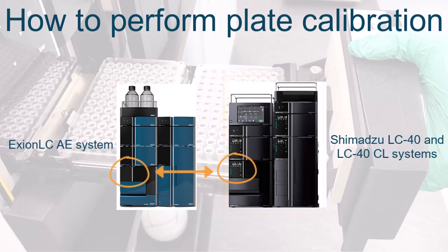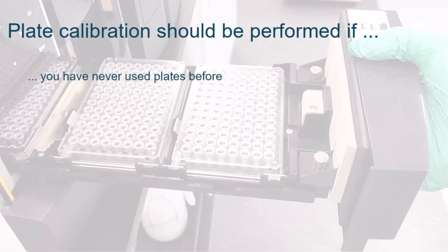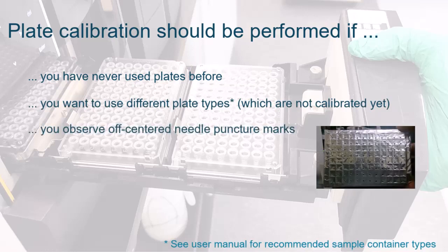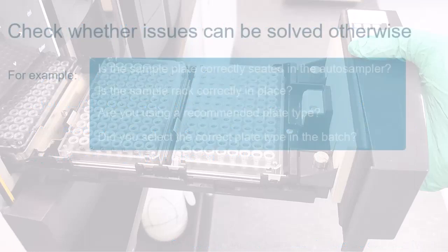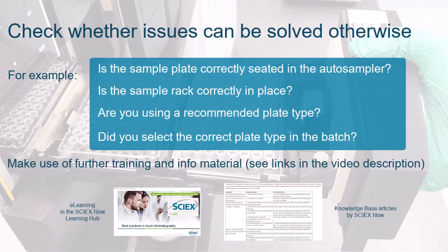The touchscreen may look slightly different, but the operation is the same for all system types. Plate calibration should be performed if you have never used plates before, you want to use different plate types, or if you have observed issues like off-centered needle puncture marks or even damaged needles. Check whether the issues can be solved by eliminating other possible causes before starting the plate calibration. Please refer to the manual or knowledge-based articles on the SykesNow Learning Hub.